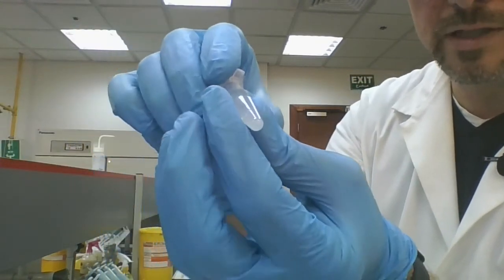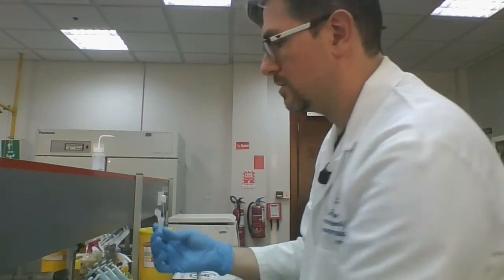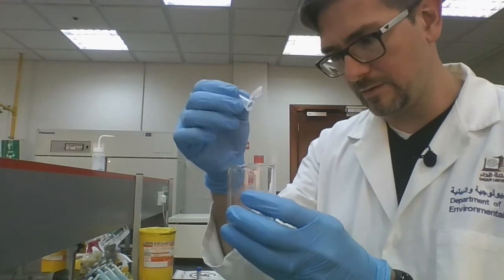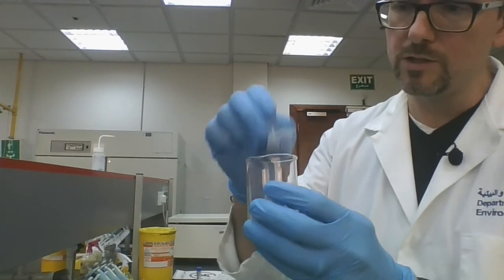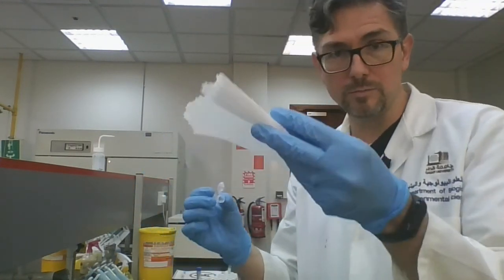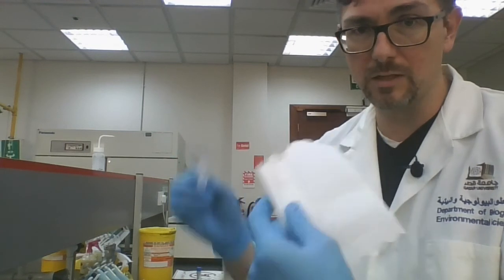Okay, so I will remove the liquid. That can go into the biohazard waste again. So I'm just going to pour it out. You don't have to be too careful. That pellet is stuck on there pretty tight. After spinning at 15,000 RPM for 5 minutes, it's not going anywhere. So shake it out well, tap it out. In fact, what you can do is take a paper towel, put it on your bench, and just tap it out over the paper towel to collect any excess liquid.